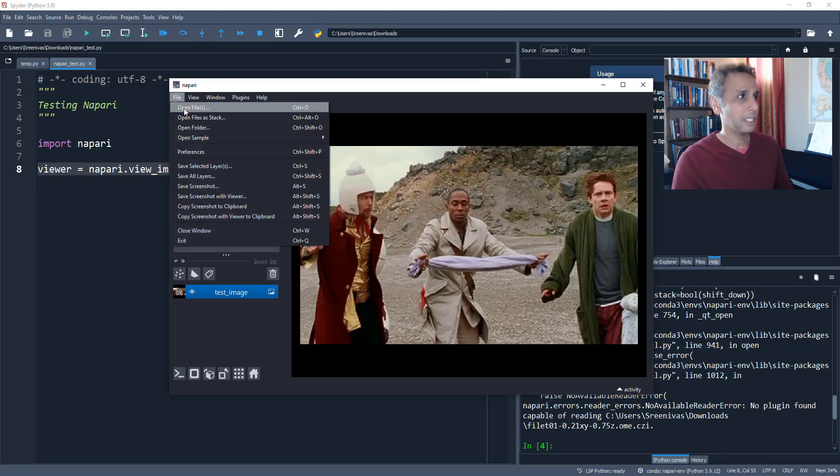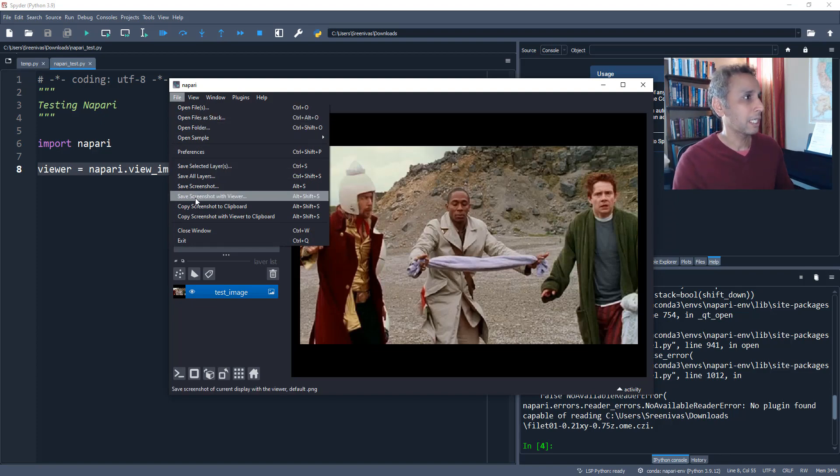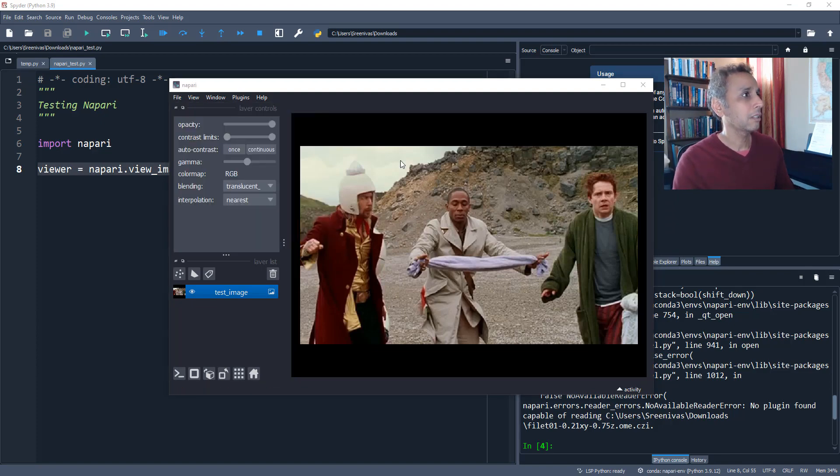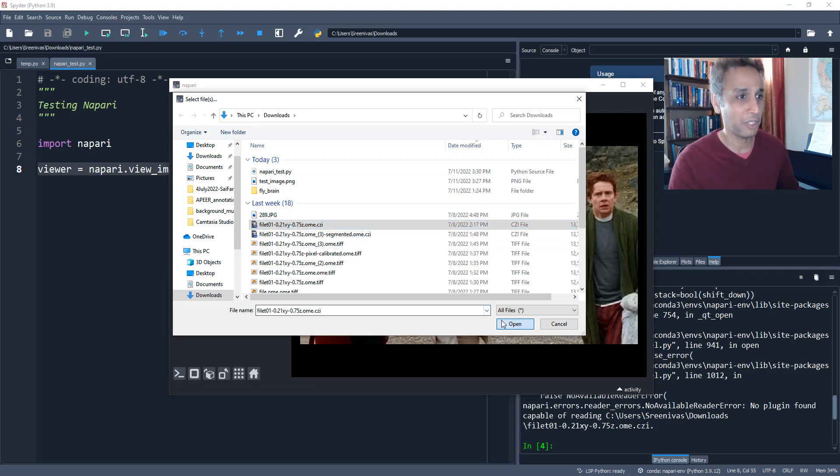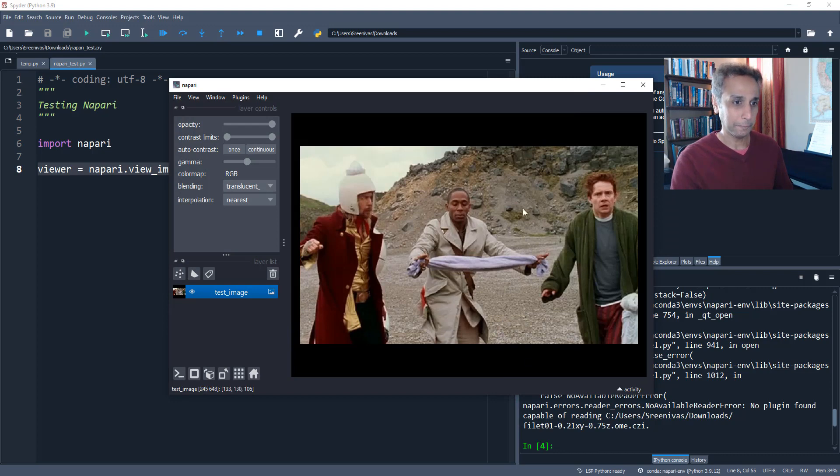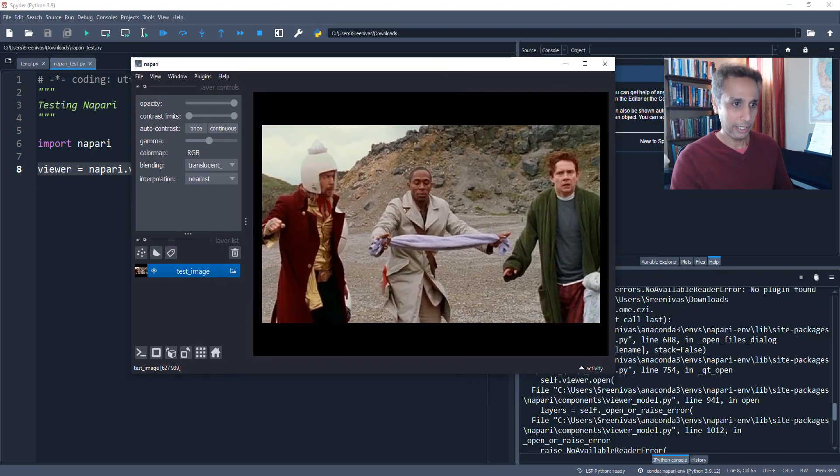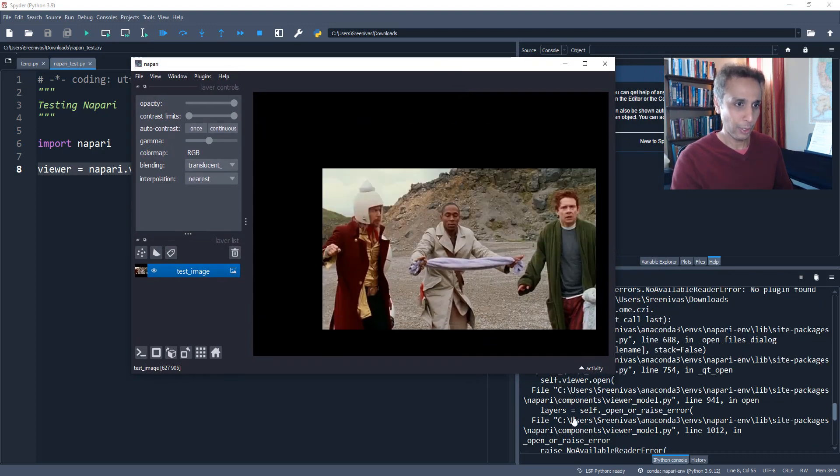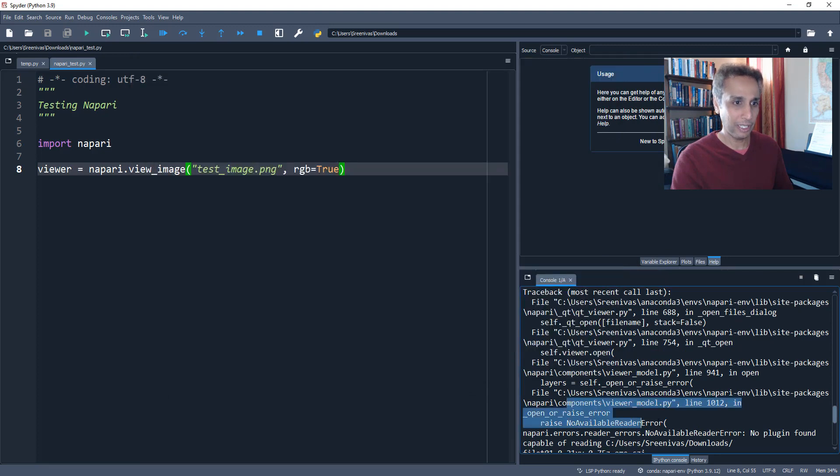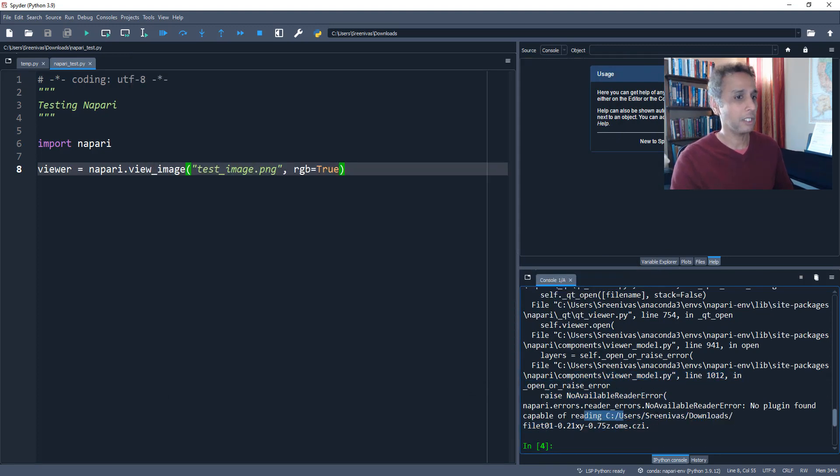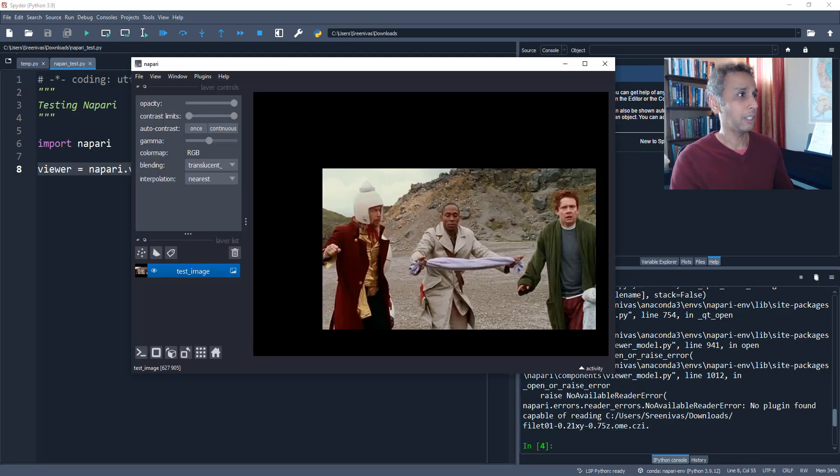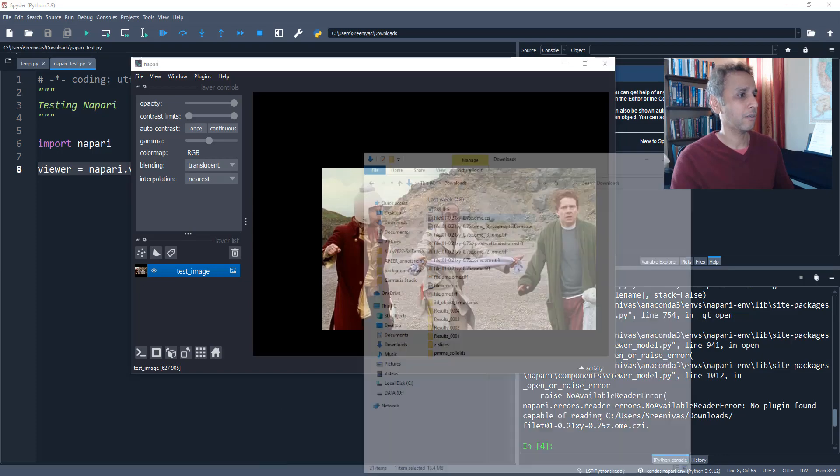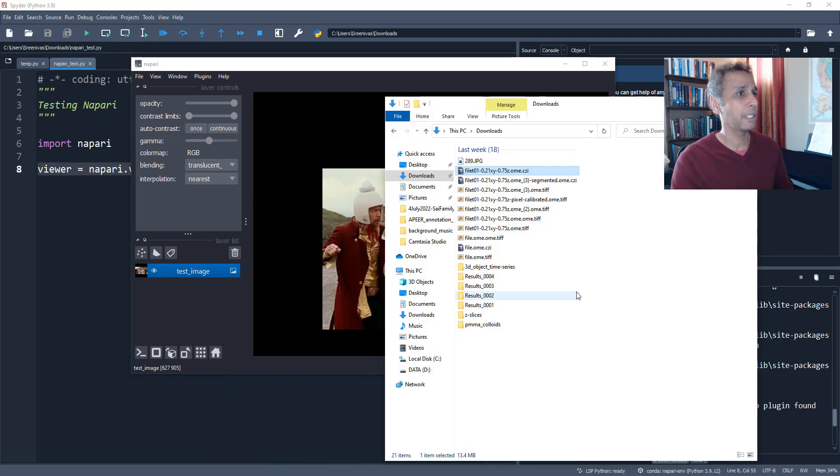What else can we do here? So let us open a different type of file. Let's open a CZI file. So open folder, open sample. Let's open a .CZI. This is the Zeiss image file. And does it open it? No, it doesn't. So it says not available reader error. So obviously I need to install some sort of a plugin, some sort of a reader to read proprietary images. So again, one lesson that we learned.